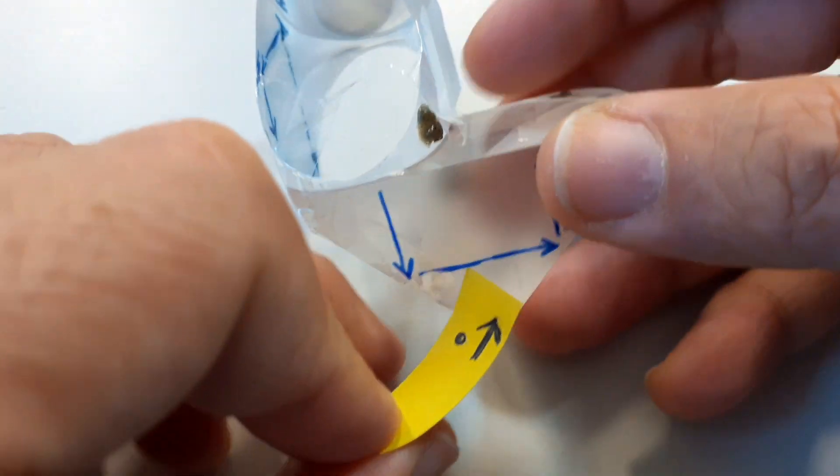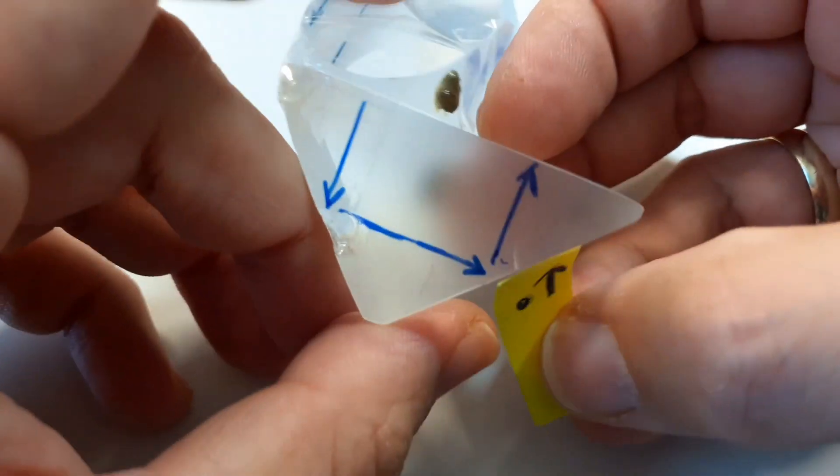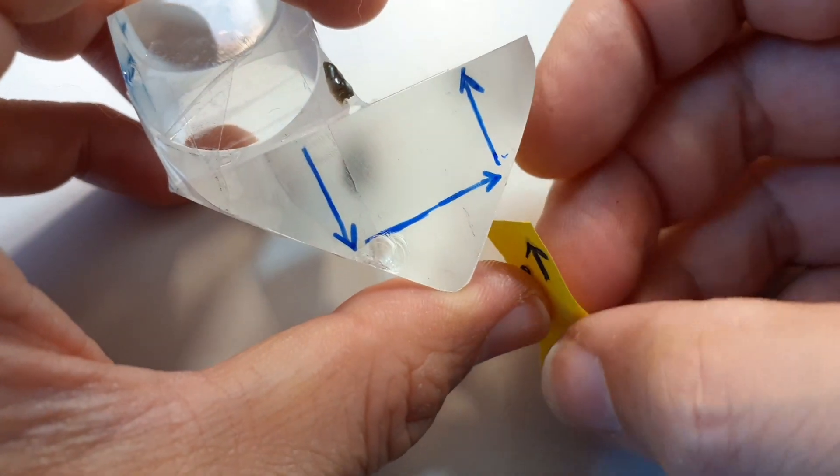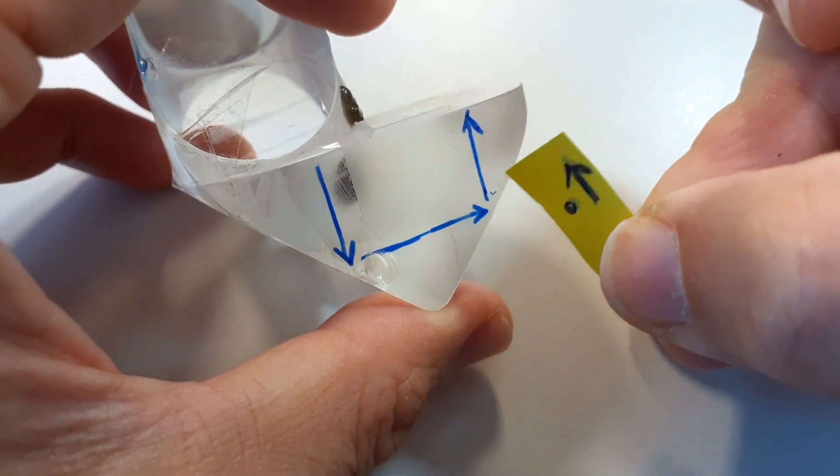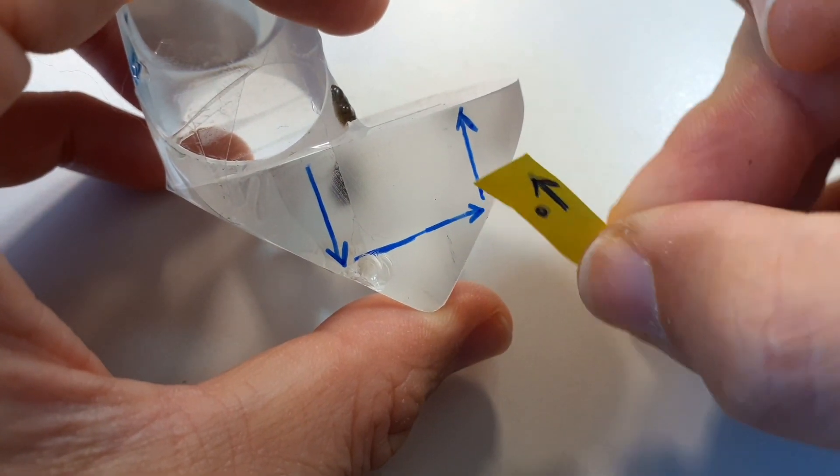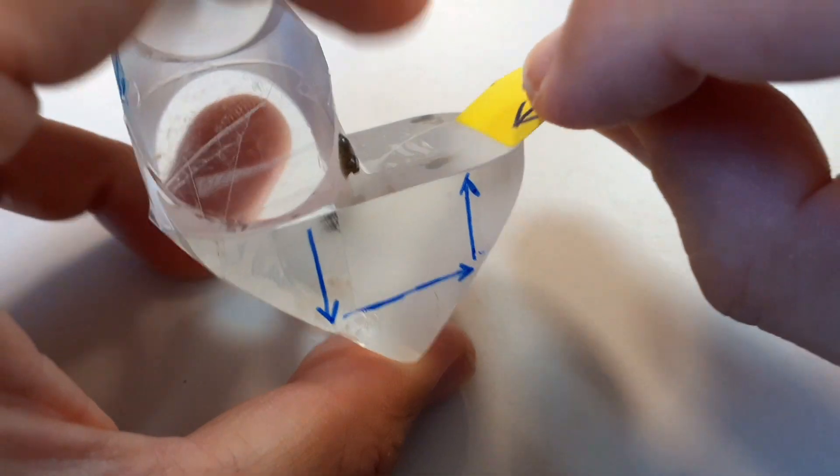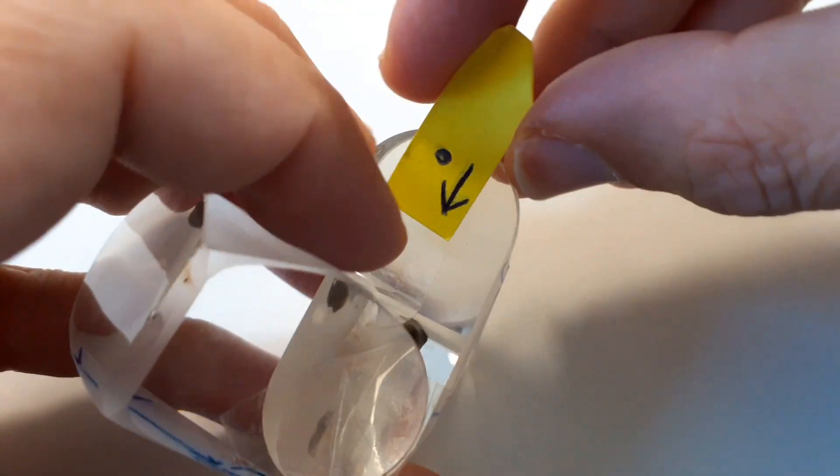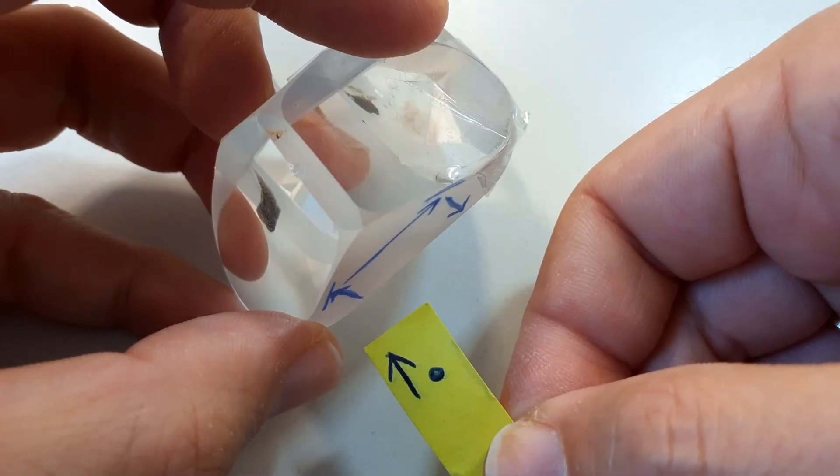And now, because of the second prism, the image is flipped upside down. And you can see that as it exits, it's basically the same. The dot is on the same place as before with the only difference that it's now rotated 180 degrees.